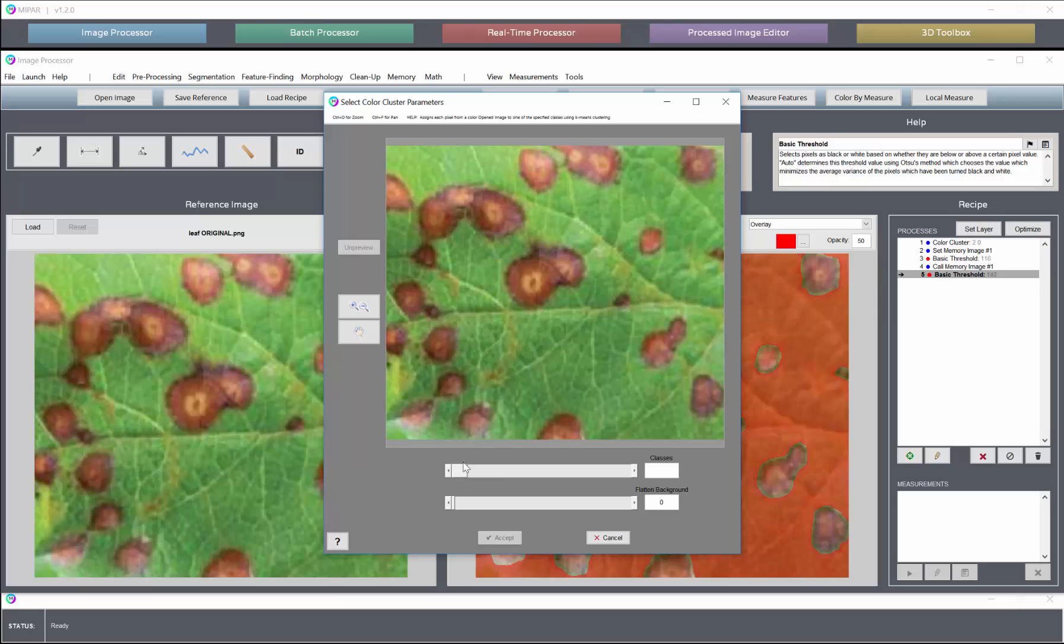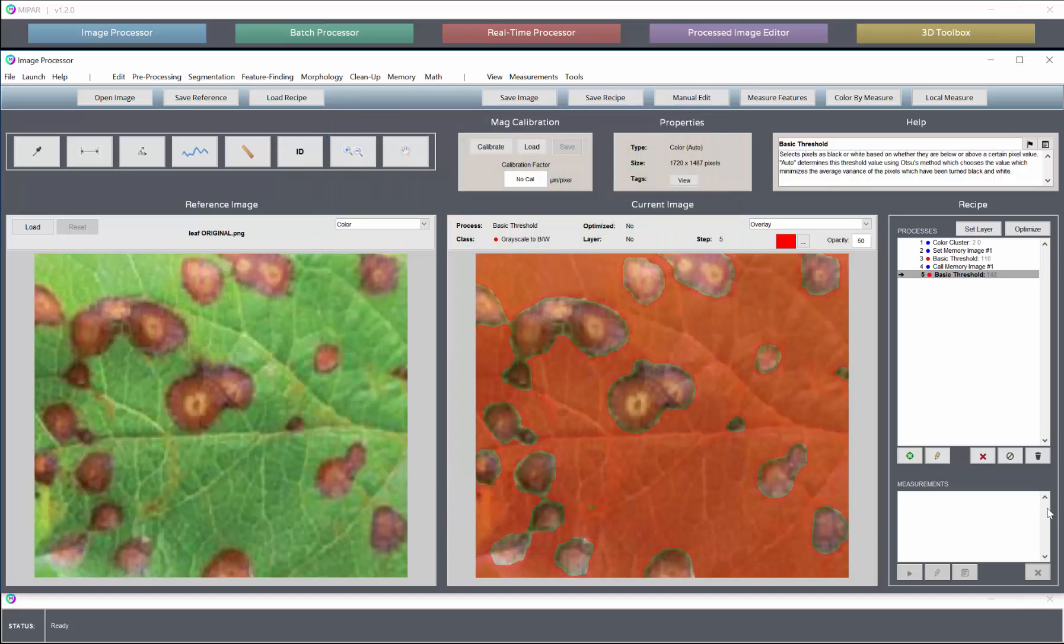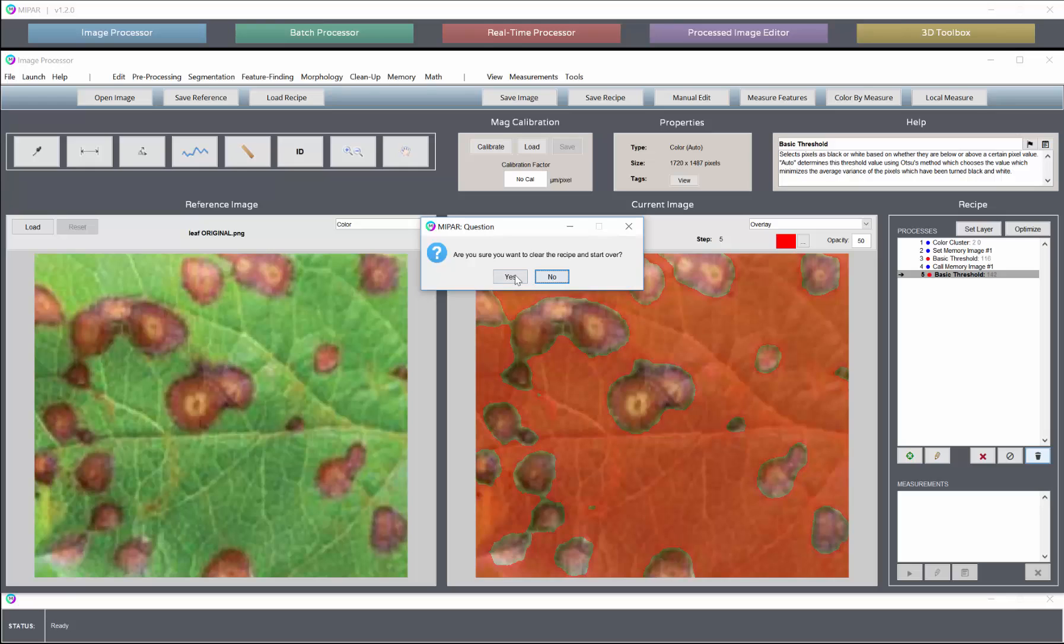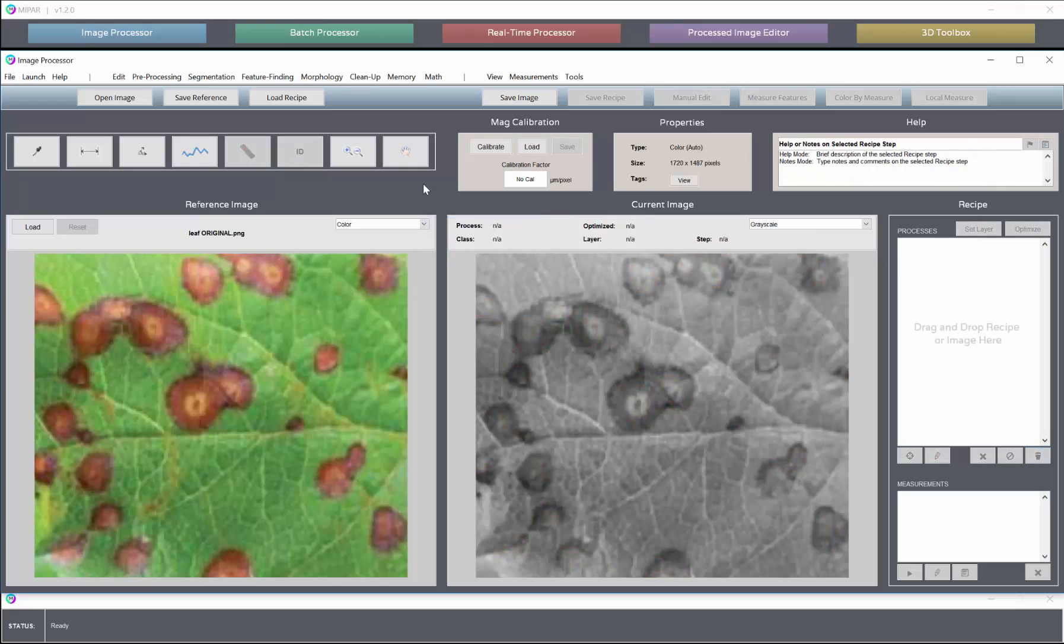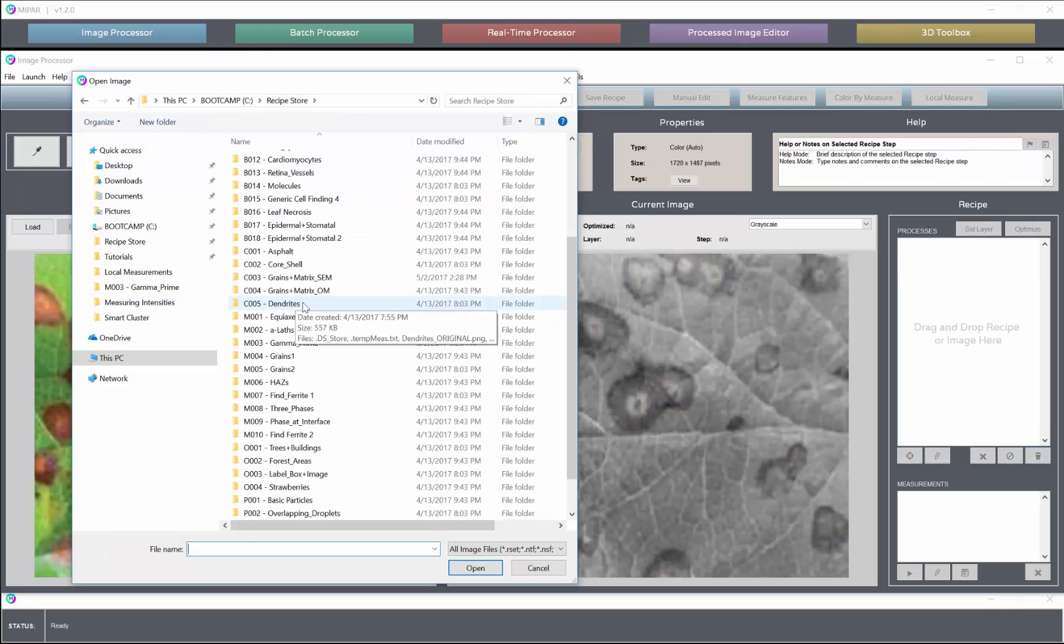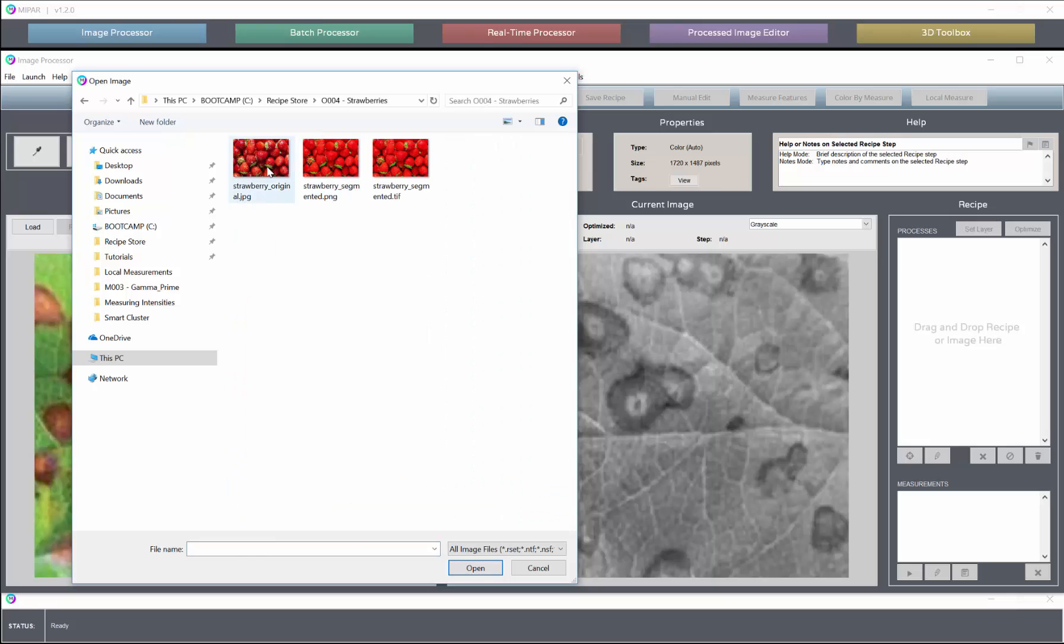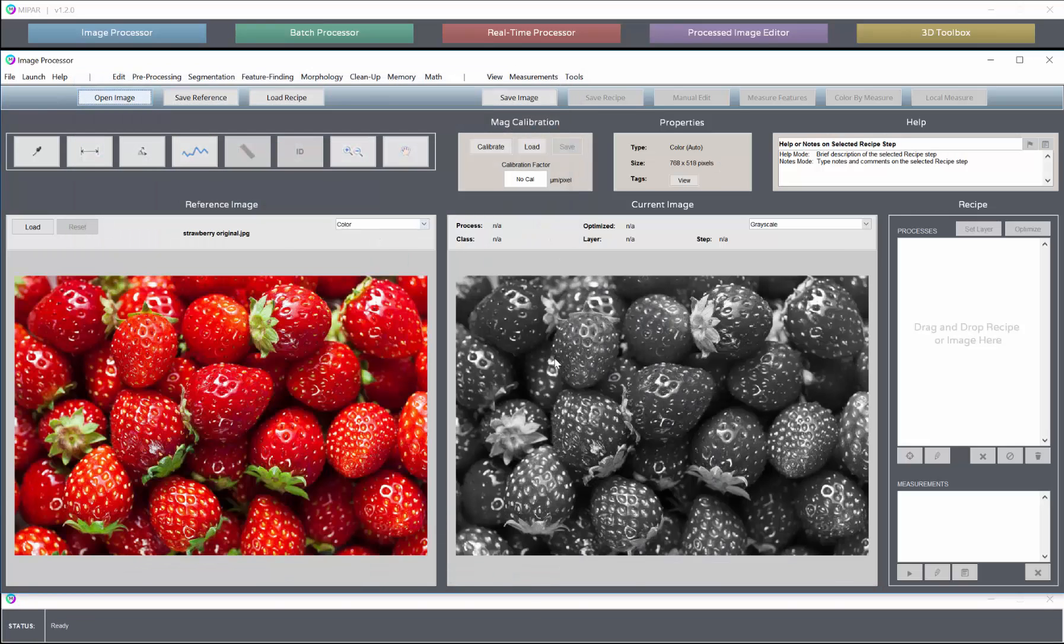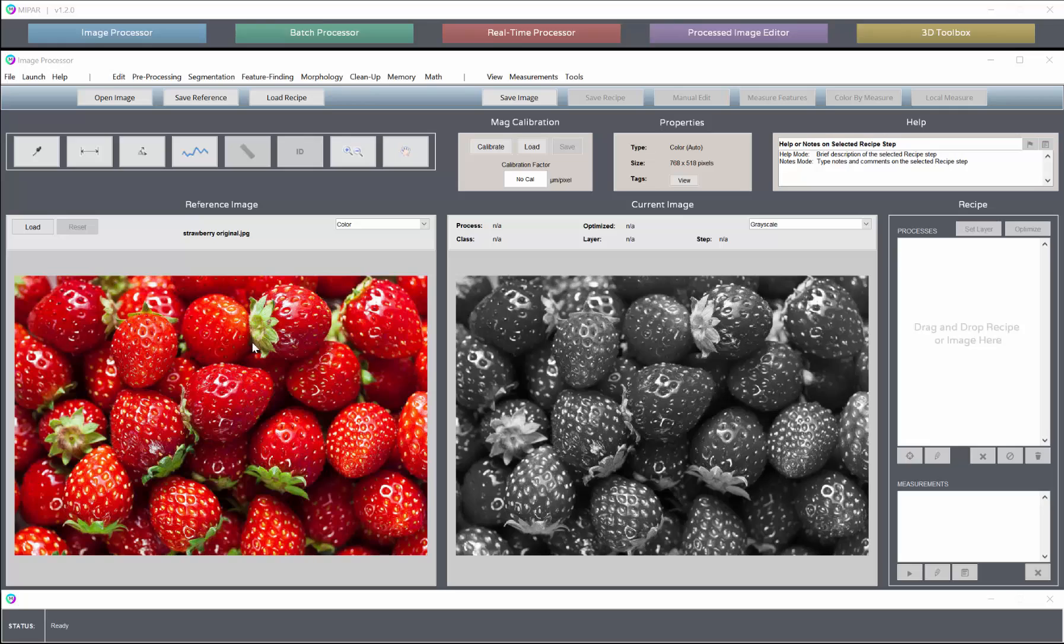So it is incredibly useful for automated and objective color segmentation. What I can also demonstrate now is a multicolor case where we have an example of some strawberries that have their red bodies, green stems, and yellow seeds.